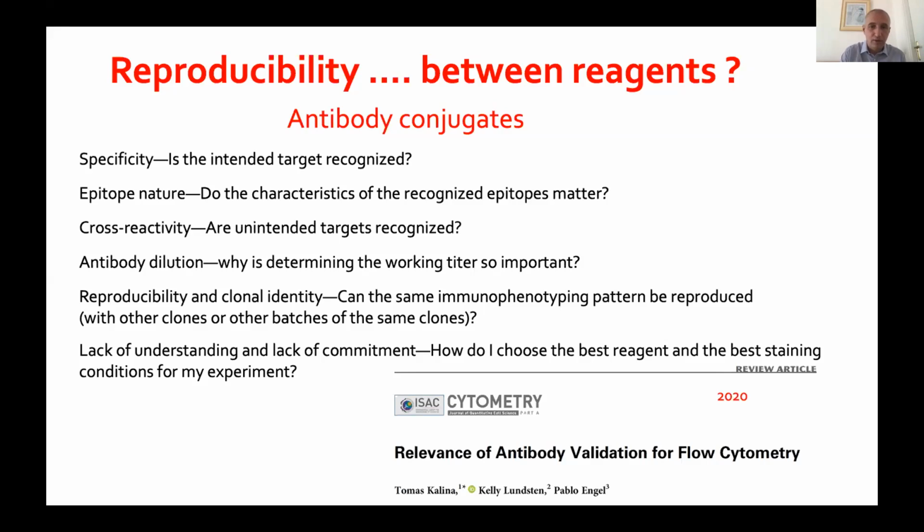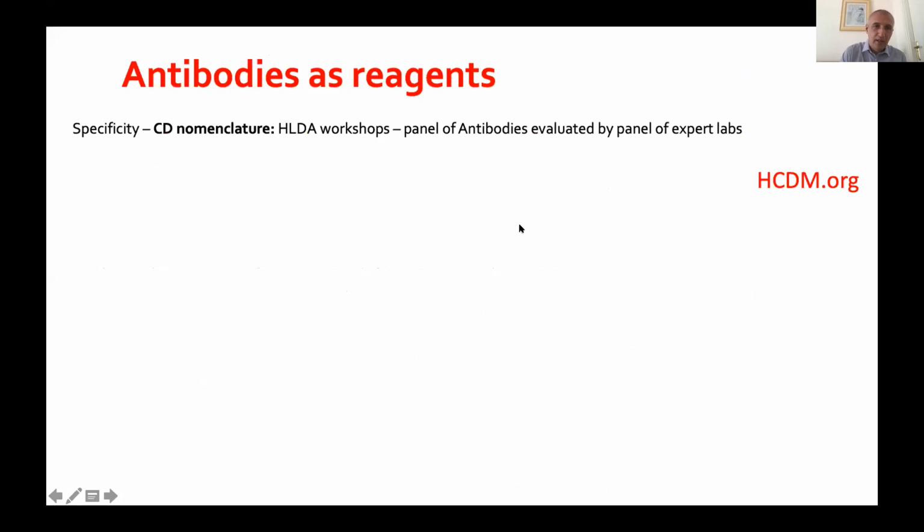And on the other hand, there is also some role for the companies that they should provide the best reagents and the best characterization for those reagents. These issues are summarized of this year. So antibodies as reagents. So we probably all know the CD nomenclature, even though not everybody is really busy thinking about it anymore because we take it as granted.